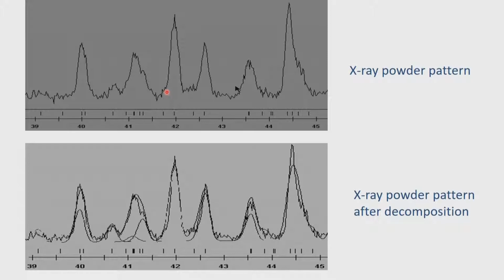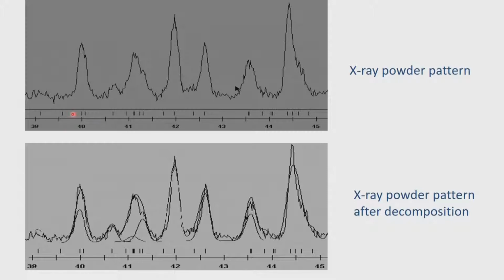Now once you have the crystal system identified, a, b, c, alpha, beta, gamma identified for the given compound, then you can calculate how many hkl values are possible and where they can appear in 2 theta. Use Bragg's equation. So when you do that, you will mark them, and the vertical lines here are the ones which actually tell you what are all the peaks that can form. If you look at a region like this, you see that there is a severe overlap of one or two peaks.